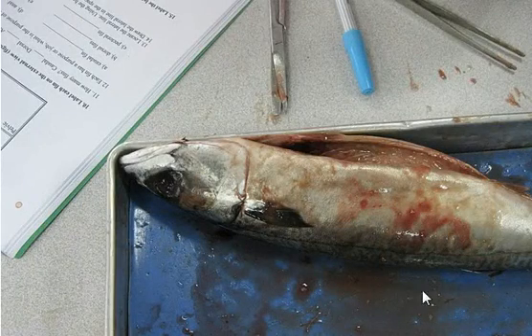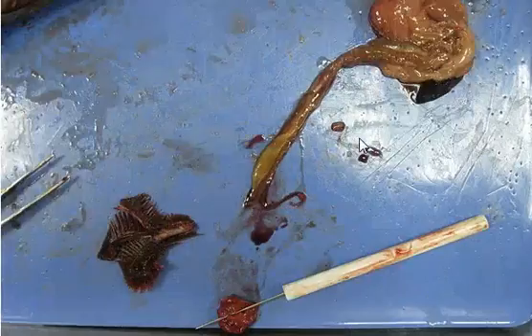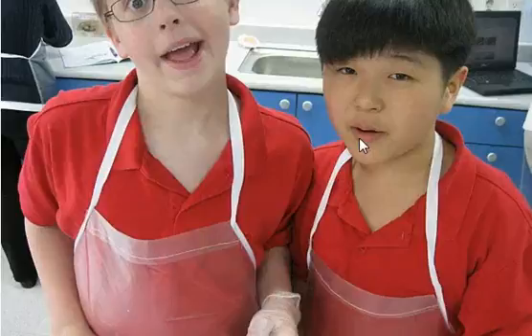This is another fin over here. And here are the two eyeballs at the back. So this was all the fish dissection, and I hope you have a good time. I nearly vomited doing this because I hate fish.